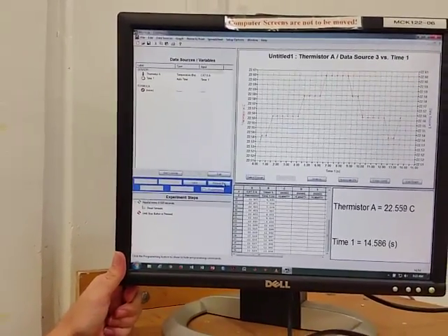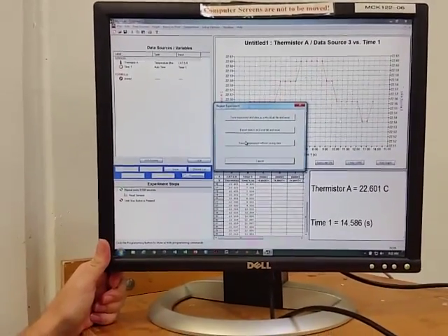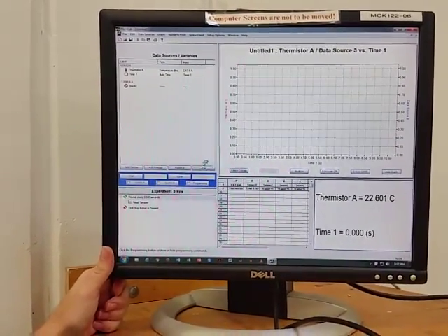And then I could say repeat experiment, and it'll give me an option to save. I'm not going to repeat experiment without saving that last data. Then it says, are you sure? I don't want to see that again. So, okay. So now it's ready to start the next one.